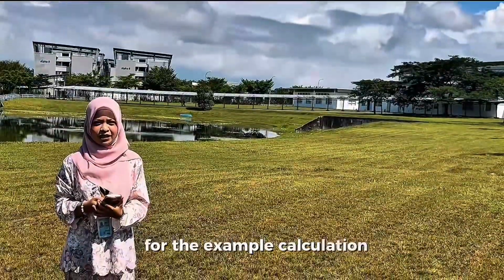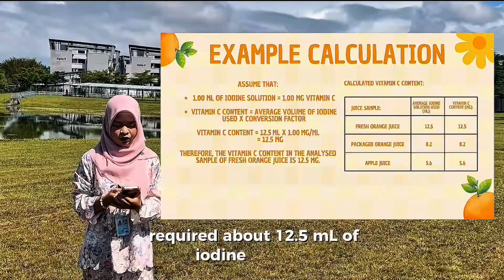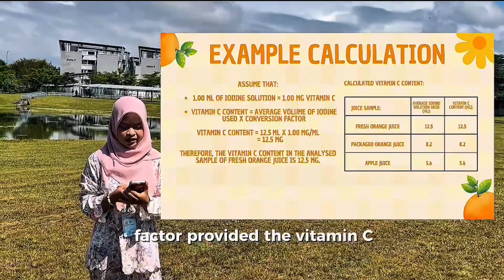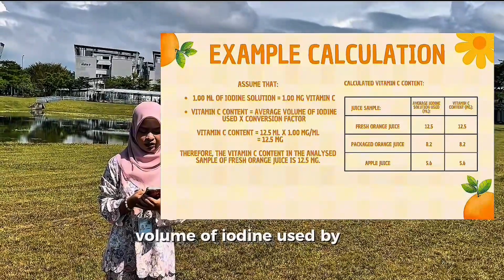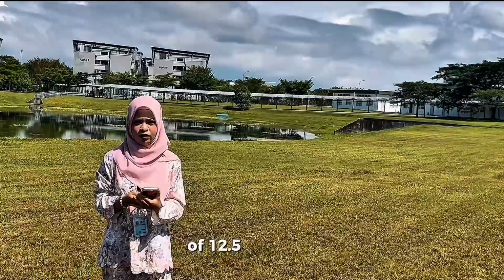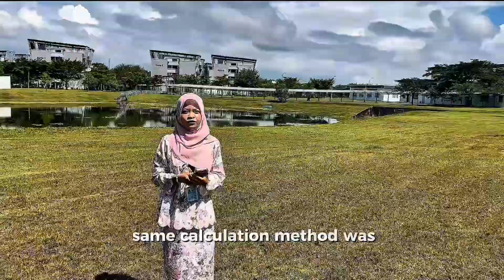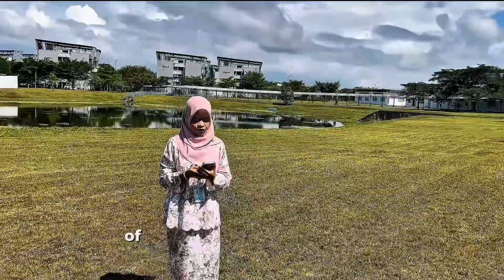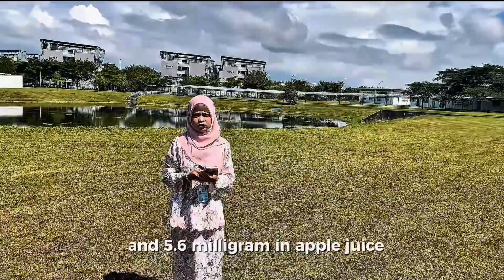For the example calculation, the fresh orange juice sample required about 12.5 ml of iodine solution. Using the conversion factor provided, the vitamin C content was calculated by multiplying the volume of iodine used by the conversion factor. This gave a vitamin C content of 12.5 mg for the fresh orange juice sample. The same calculation method was used for the other fruit samples, resulting in 8.2 mg of vitamin C in packet orange juice and 5.6 mg in apple juice.